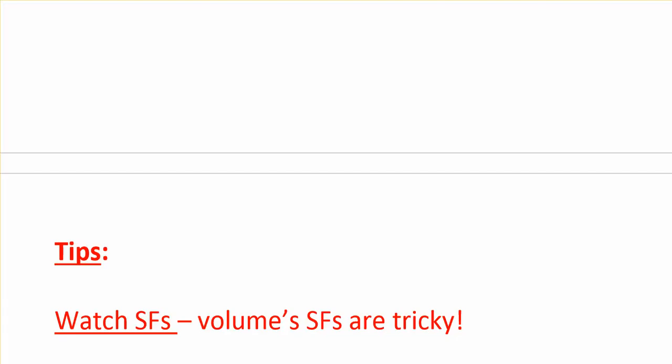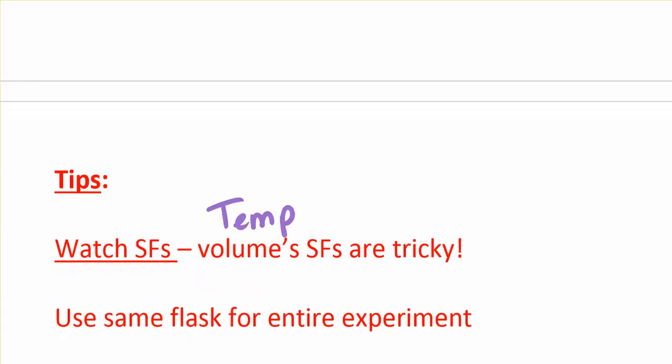Let's look at our tips. You're going to be graded on accuracy, and of course significant figures are part of that. So the first thing is to watch your sig figs. Be sure that you record the temperatures exactly how I told you with the right number of sig figs. And we just talked about the volume significant figures.